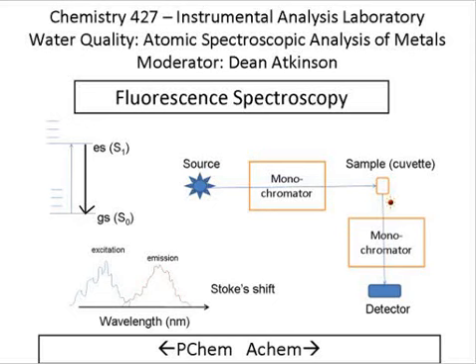catch all of the photons. Because we can't steer photons, we're probably only going to be able to detect photons that hit our detector. So that's a bit of a bad thing. Means we're not going to detect all of the photons that are created as a result of this process. But really, it's a very, very good thing because it means that we can put the detector anywhere we want. And so there's sort of an infinite number of possibilities.